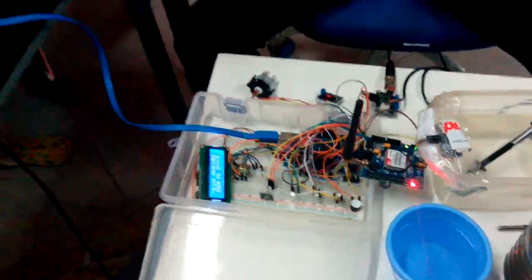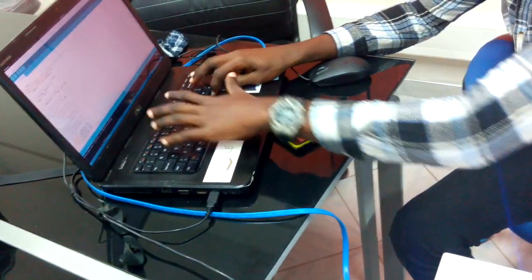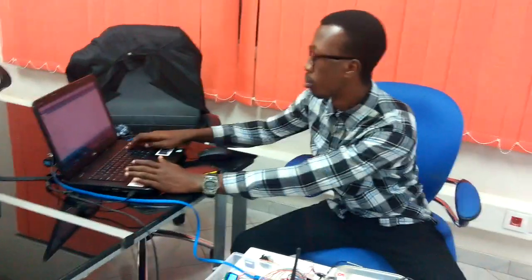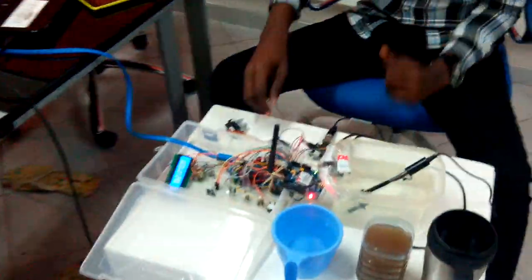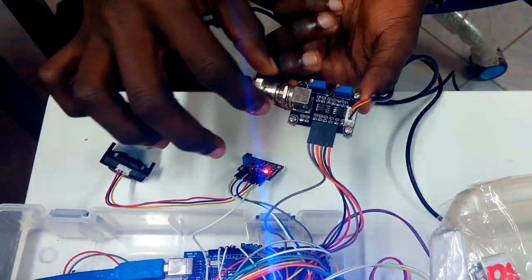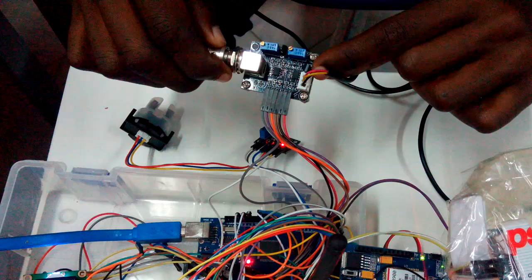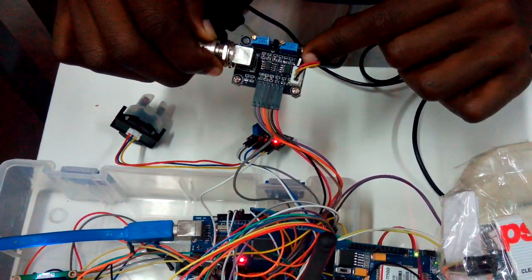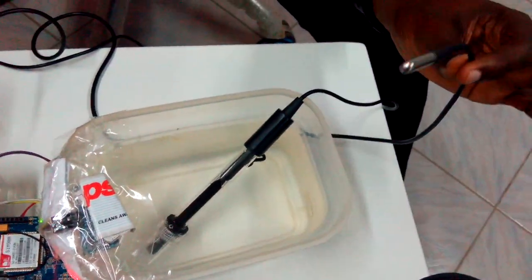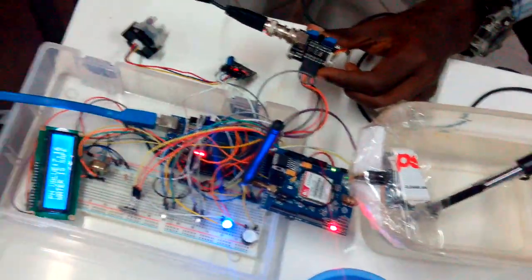Now we are going to the temperature in the water. The temperature probe is connected to this sensor — it is both a pH sensor and a temperature sensor at the same time. This also has a temperature sensor that takes the surrounding temperature and the water temperature. The code we have written takes care of both the surrounding temperature and the temperature inside the water. I will now upload the code into the system.